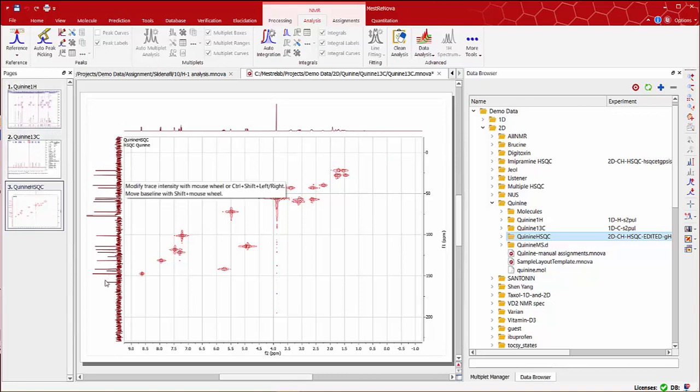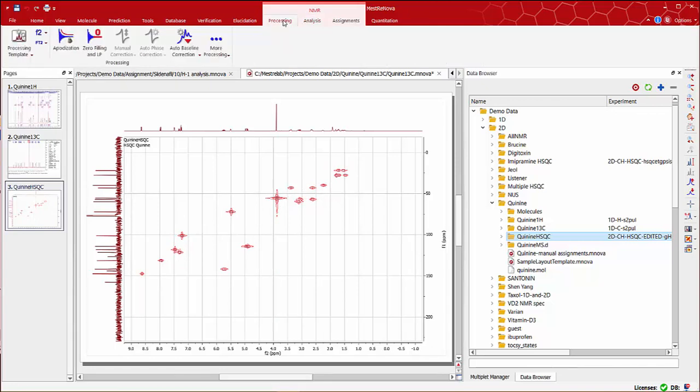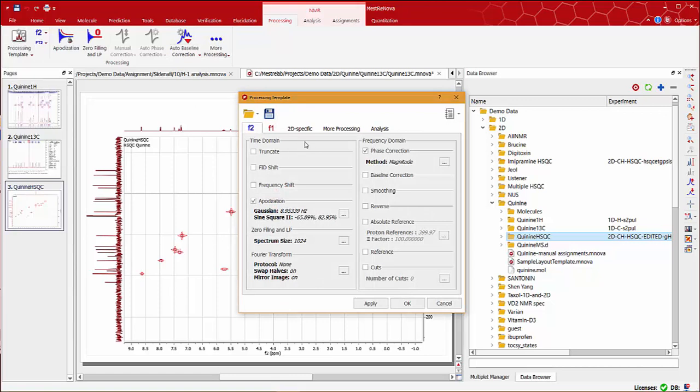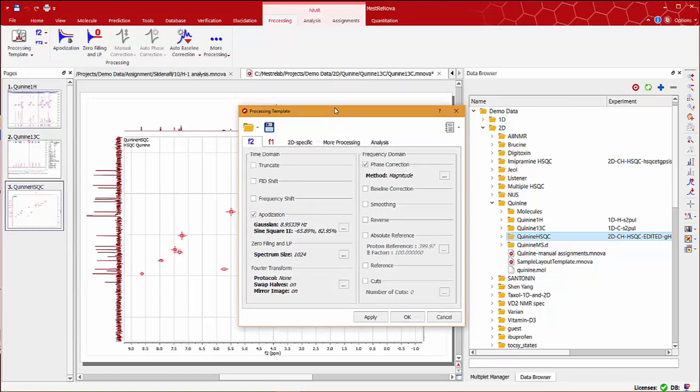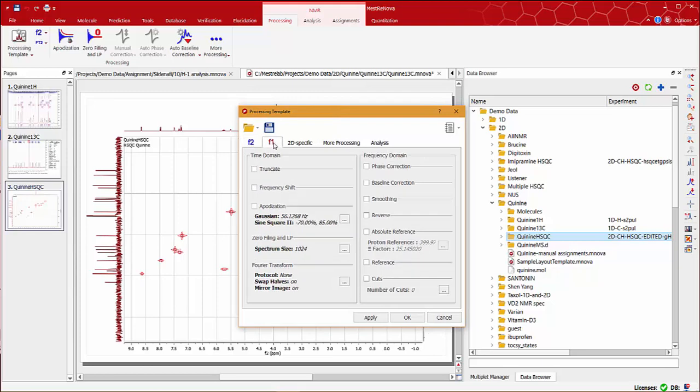Now, you may want to improve the peak shape of your spectra. To do this, go to the NMR processing tab and click on the processing template. In the processing template window, you can see all parameters applied to both dimensions F1 and F2.